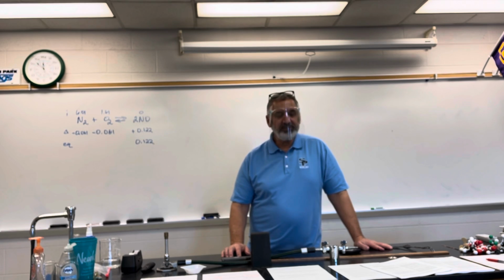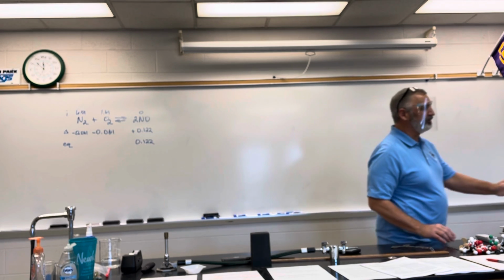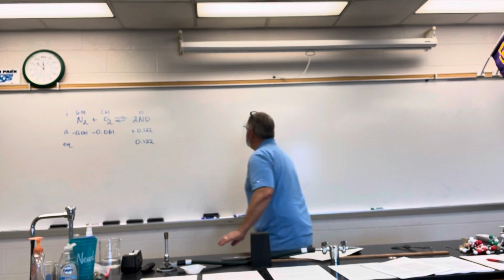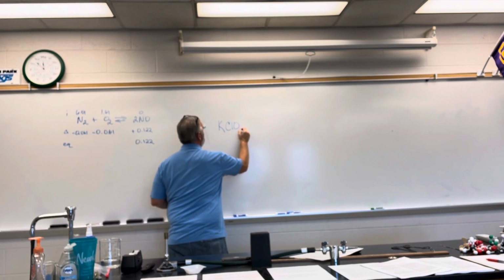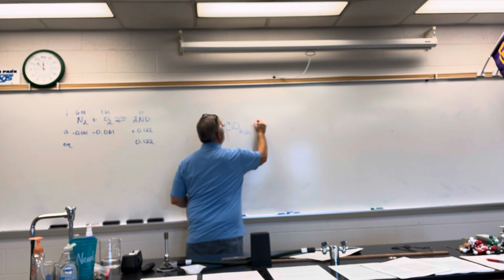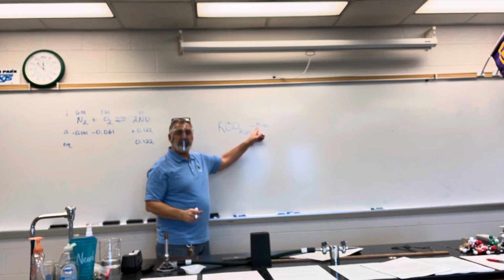So today we're doing the lab, and we're going to be determining the percent oxygen in KClO3. Now, when you're reading over this, it gives the equation that KClO3 solid, when heated, and in our equation, if you just put a triangle over the arrow, that's going to imply heat.